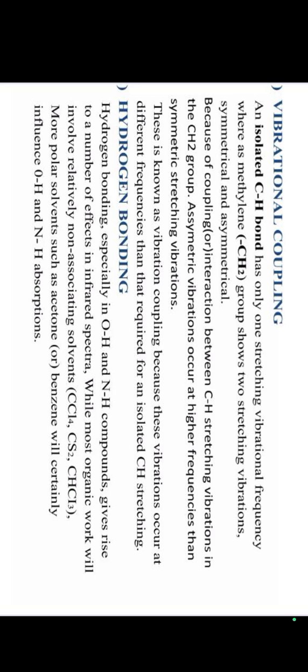Second one of the factors affecting is hydrogen bonding. In hydrogen bonding, OH and NH compounds give rise to a number of effects in infrared spectra. While most organic work will involve relatively non-associating solvents like CCl4 or CHCl3, more polar solvents such as acetone or benzene will certainly influence OH and NH absorption. So hydrogen bonding also affects the vibrational frequencies.